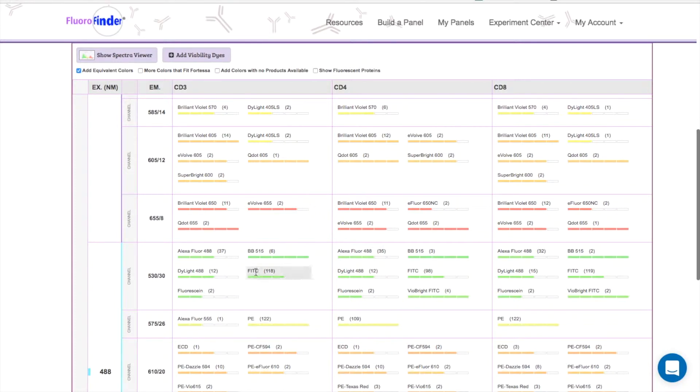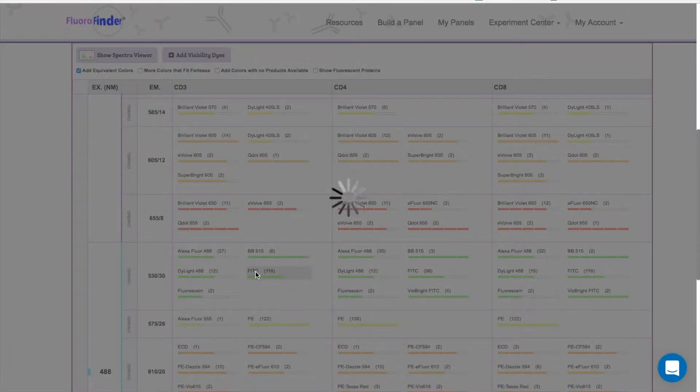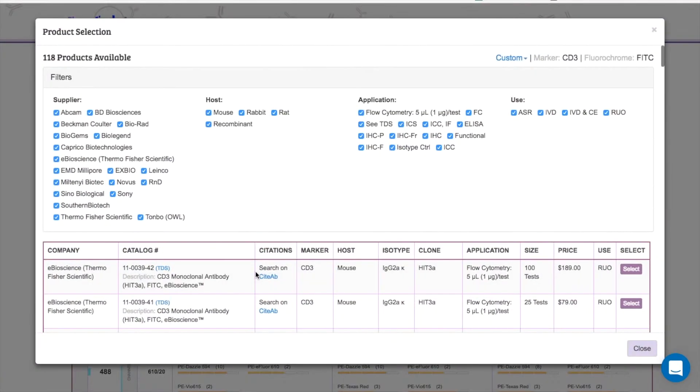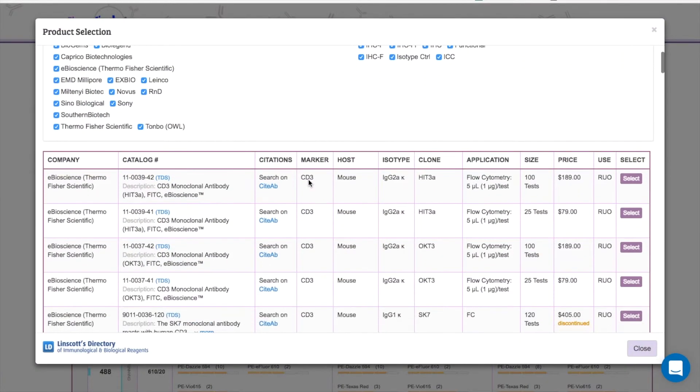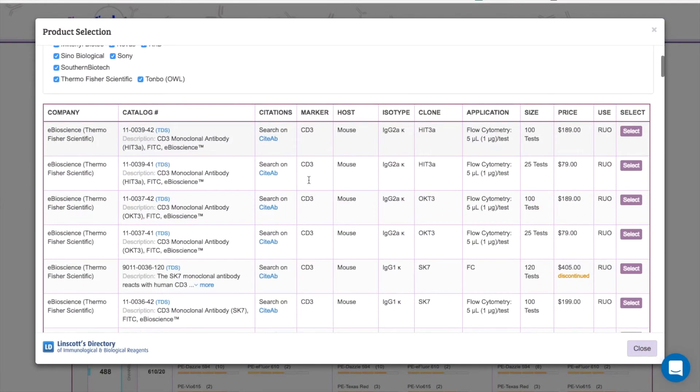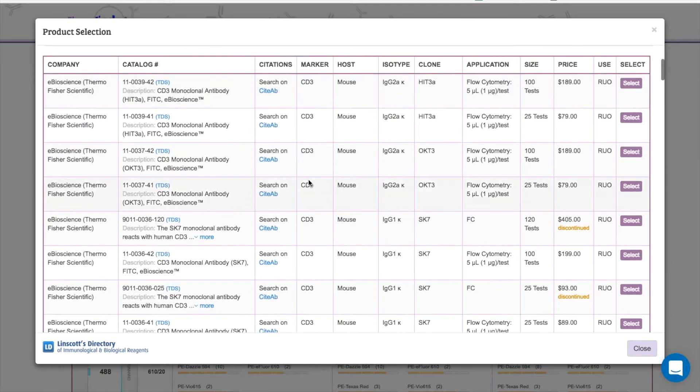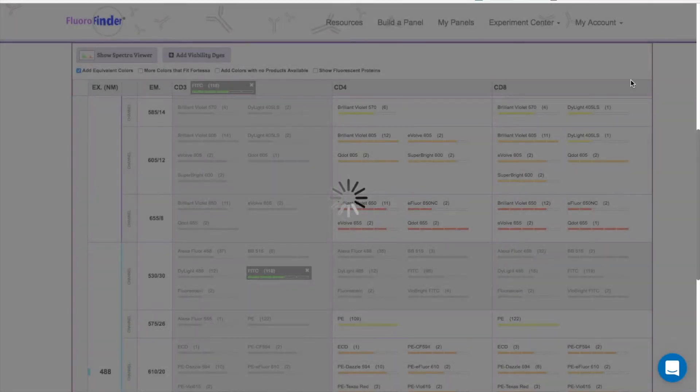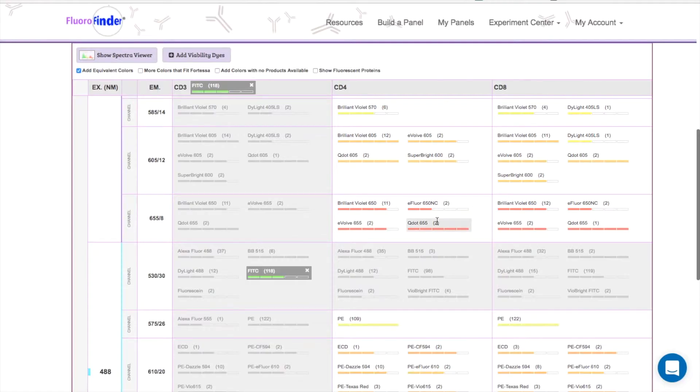So let's say I want to use FITC for the CD3 marker that I entered in the previous step. When I click here, a window will pop up where you can select from all CD3 FITC markers that we have in our database. I'll go ahead and just select one.